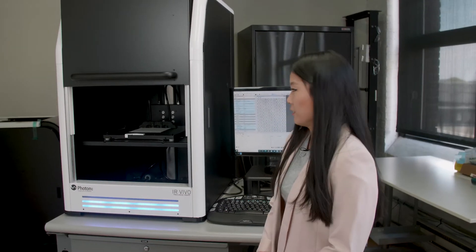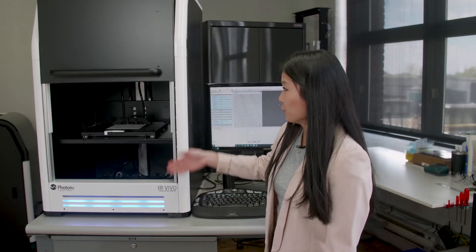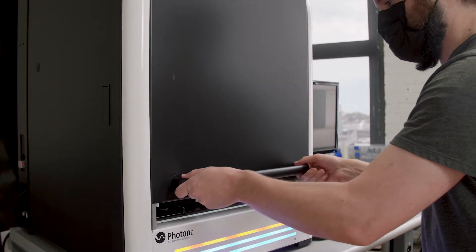For the purpose of this guided tour, we have altered the door so we can see what's happening inside even though it's open.